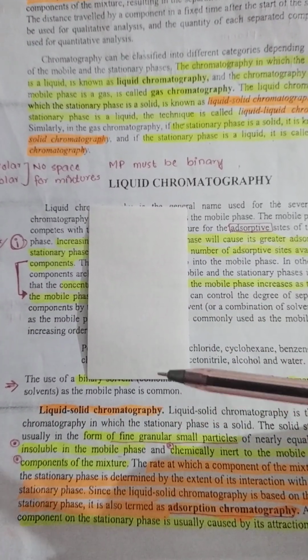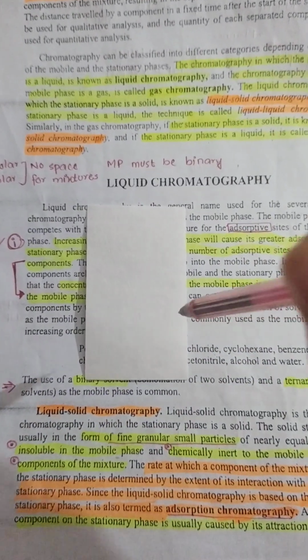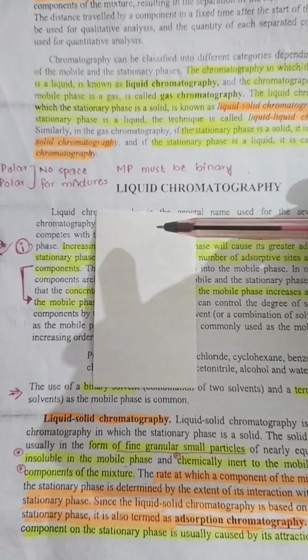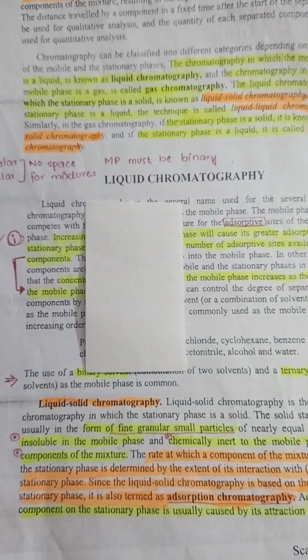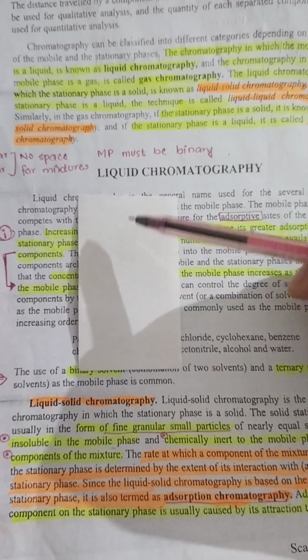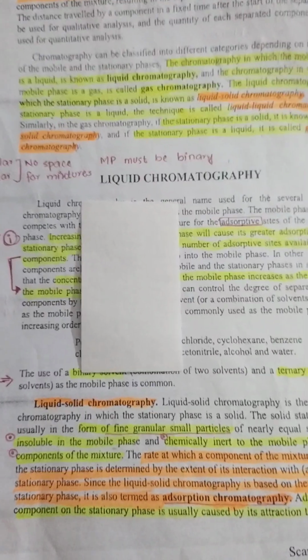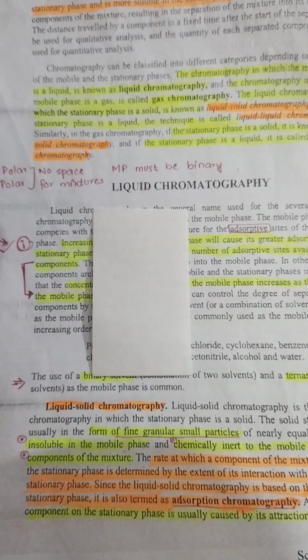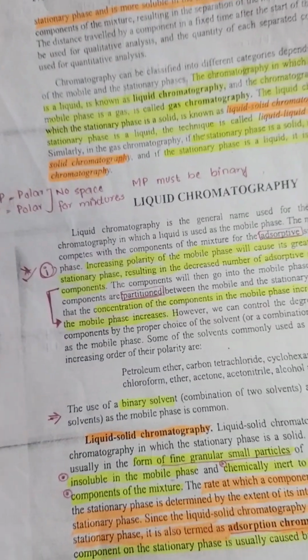If our component is polar, it adsorbs on the stationary phase. If our component is less polar, then it travels to this side, to the end of the paper, because it is less polar. The "like dissolves like" phenomenon is applied in this method. If the component is polar, it is tightly bound to the stationary phase. If our component is non-polar, it is less tightly bound to the stationary phase.